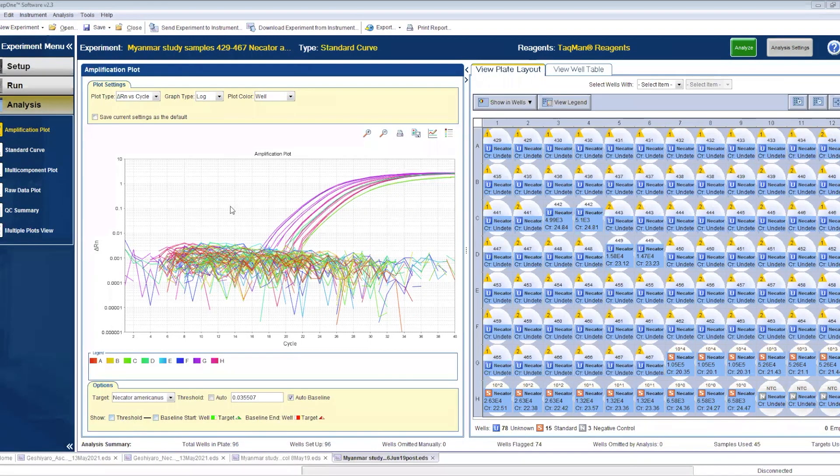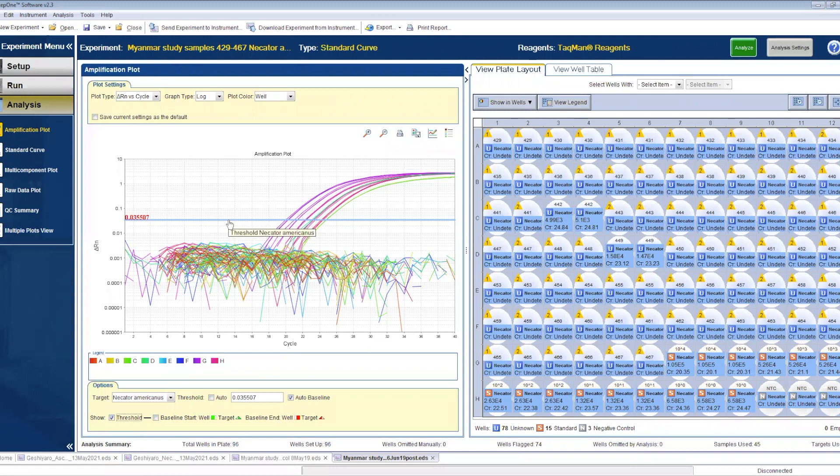The software has a good sense of threshold adjustment. Always ensure the bar is at the beginning of the exponential phase. If not, adjust accordingly and click Analyze after you finish.